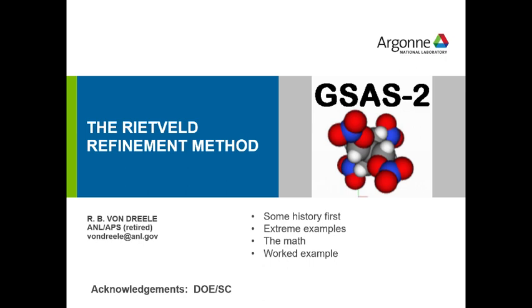Okay, that's the logo for GSAS-II. So you'll see it scattered all around, and when you install GSAS-II, it shows up on your directories and all that sort of stuff. But that's what that is. It's sort of a reminder of my time in Los Alamos. It was an interesting experiment, especially from the safety point of view.